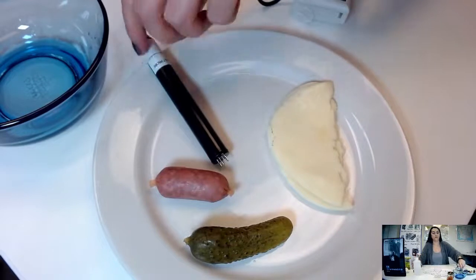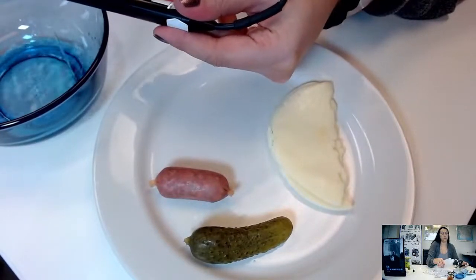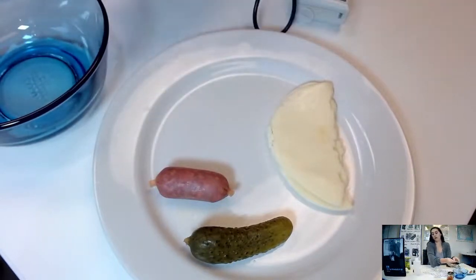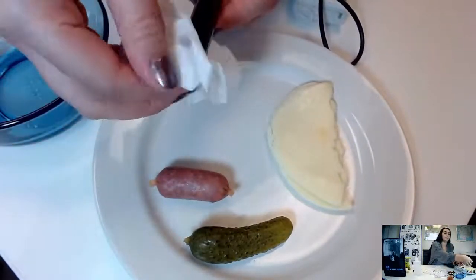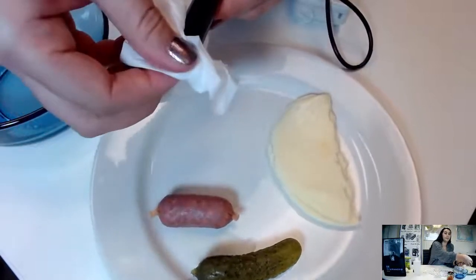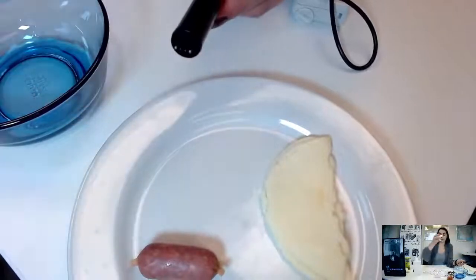Right. Now we're just going to rinse that, get the sausage salt off of there. Gently wipe. Okay. Perfect. Just like that.